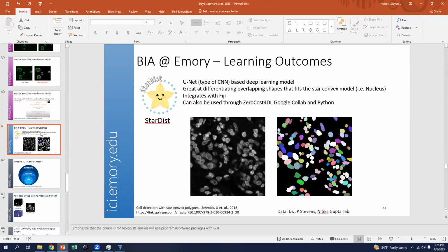What that means is they have a model and they have trained it on a lot of annotated data. Because we're going to talk a little bit more about this tomorrow, I'm not going to discuss it as much now, but essentially, if you have a set of annotated, labeled images, and what those words mean is a human has looked at them and said, these are definitely the structures that exist in this image. Those are fed to the model, and then the model extracts the patterns that it sees in those images. So a well-labeled image generally trains a model that can effectively distinguish structures. If the image is poorly labeled, you're going to have a bad model.